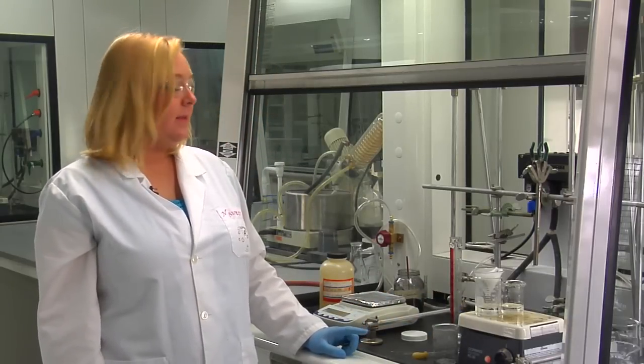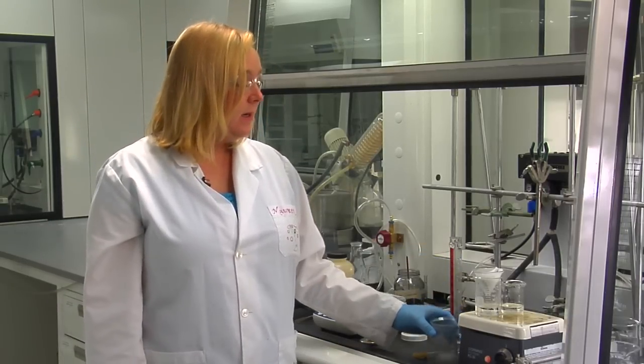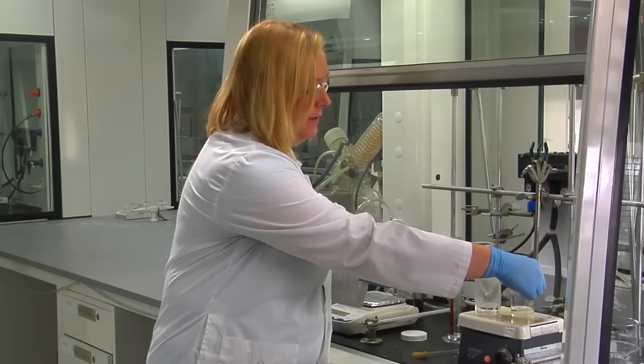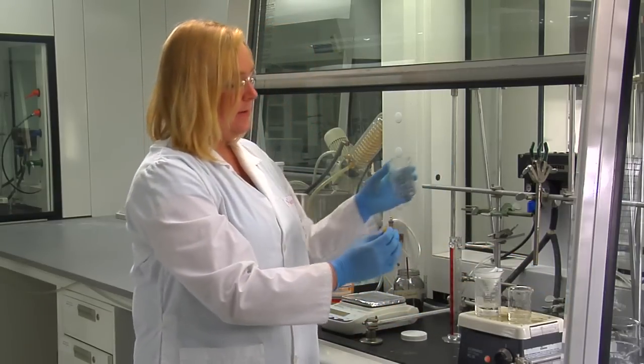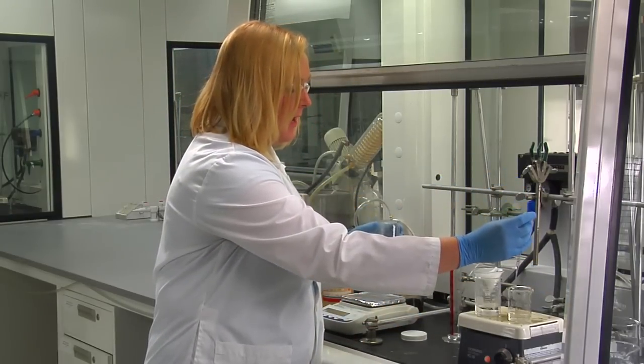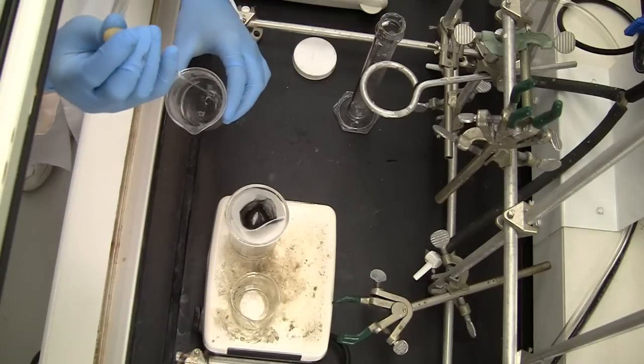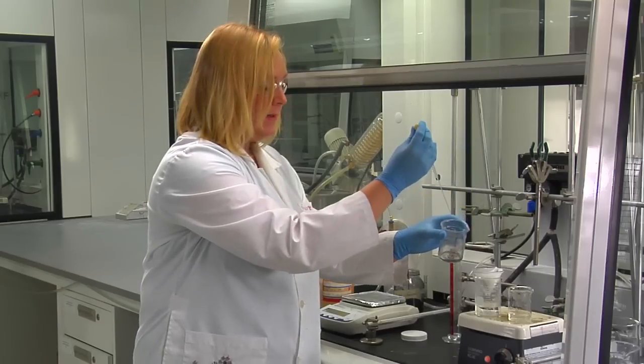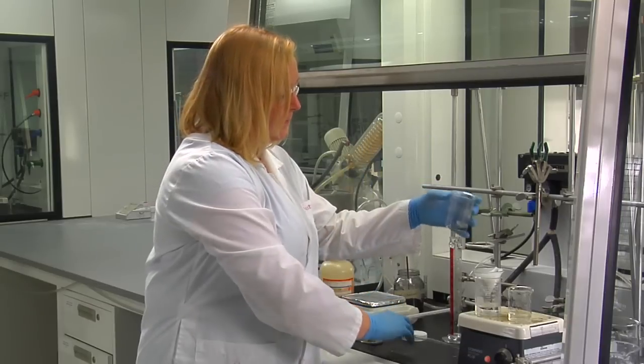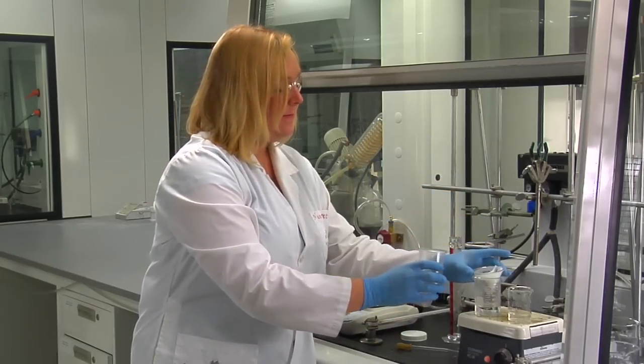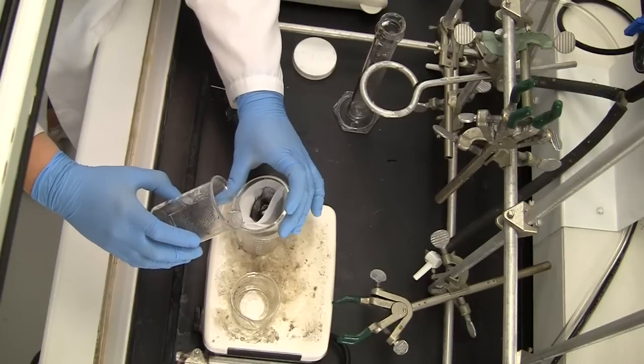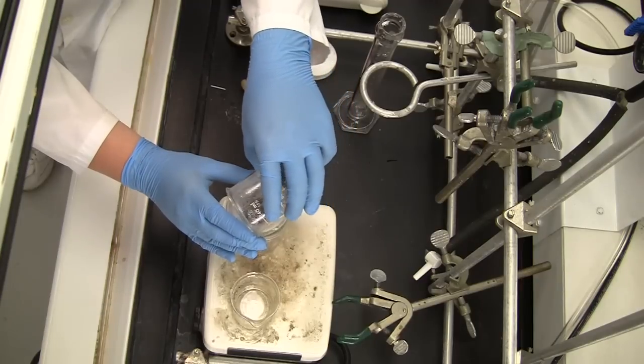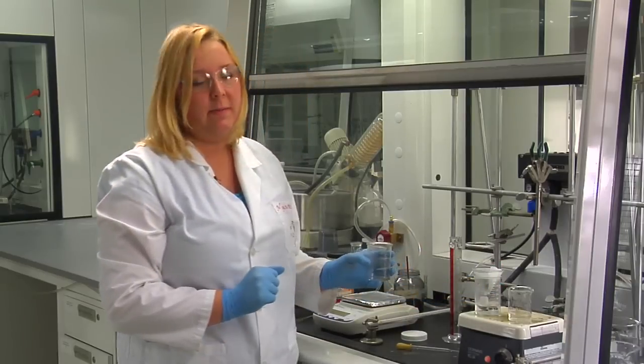Once you've filtered the entire solution through the filter paper, to ensure you get the maximum amount of salicylic acid, you can use some of your hot water still on the beaker to rinse out the original beaker and the filter paper. You can use just a few mils of hot water to rinse the beaker, and then you can put it through the funnel, rotating around, to rinse off the filter paper of any salicylic acid that may have precipitated onto the paper.